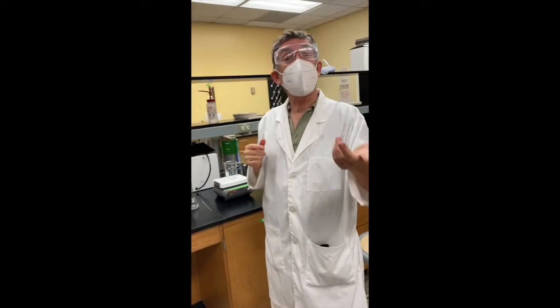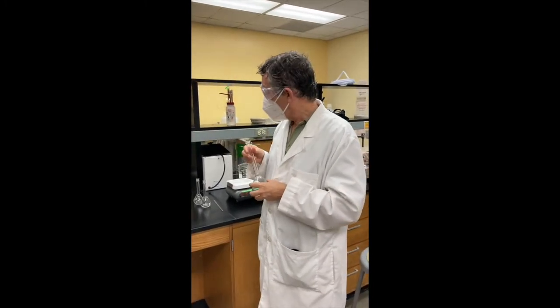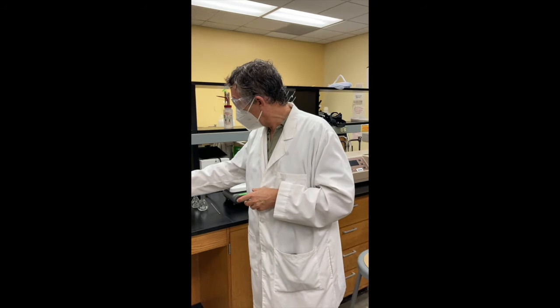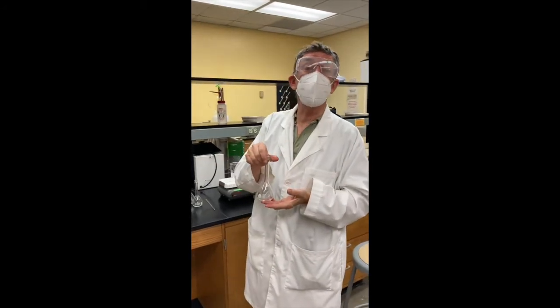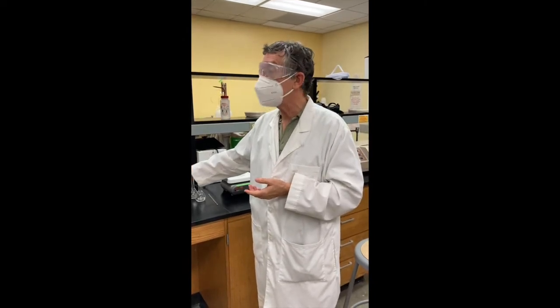Two details that I forgot to mention. One is that when you're transferring the liquid into the 100 milliliter Erlenmeyers, you will need to use a volumetric pipette to do that. 50 mils, I believe it is.